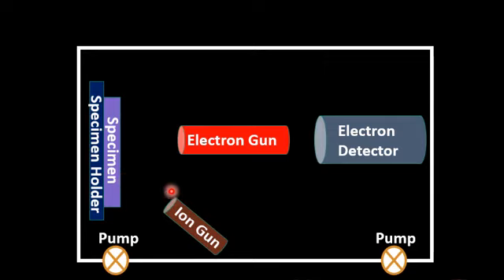Secondly, the ion gun has another important role if you are going to do Auger electron spectroscopy in depth profiling, or underneath the layer which is placed on the sample surface. Then a stream of the ion beam with higher energy is incident onto the sample surface and removes some part of the sample surface or the layer of the sample.